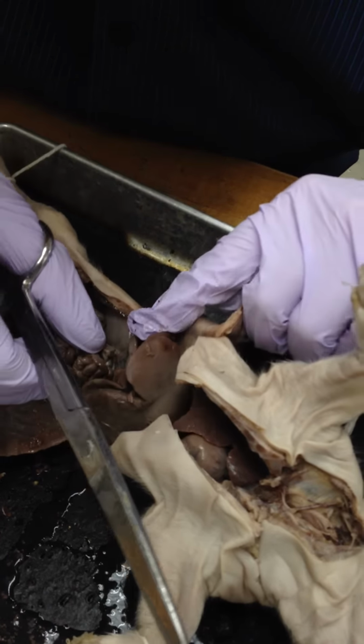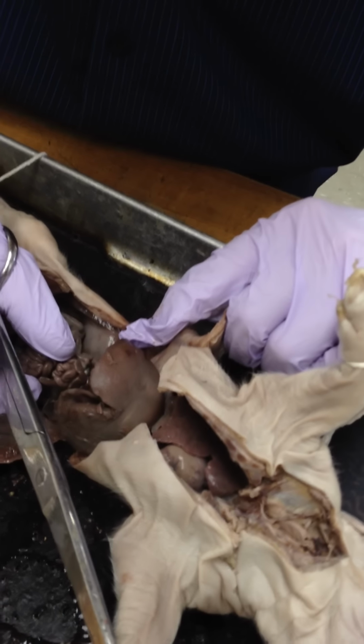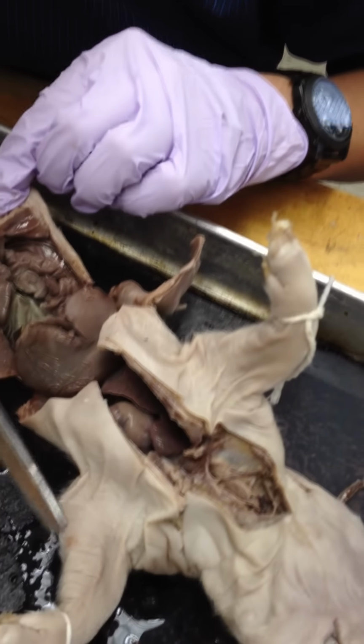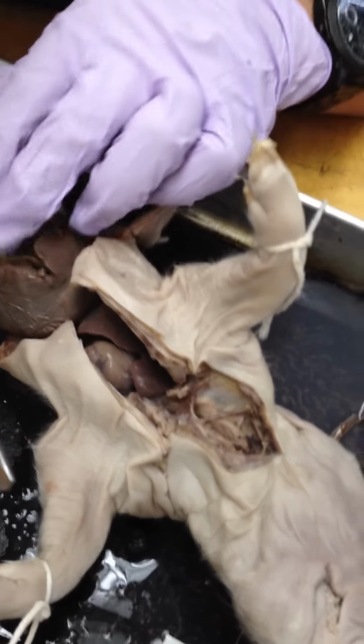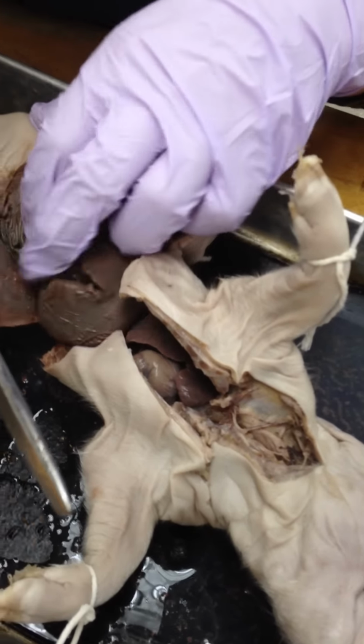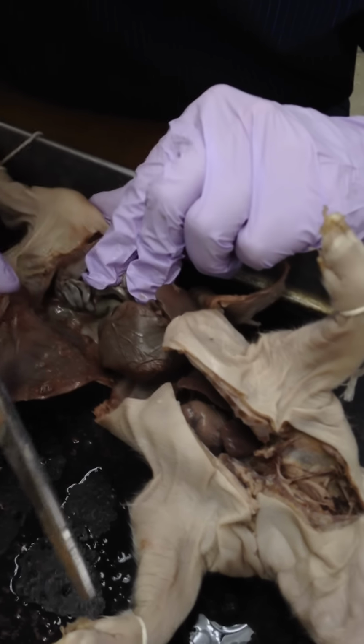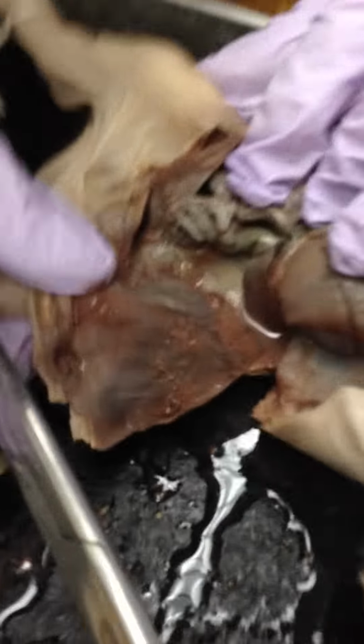Okay. Are you guys not? Well, I'm dying. Yeah. No, I'm dying too. Leo is like a soldier. He's going through that nerve gas, just like no problem. Yeah, I'm a soldier of academia. There's the other kidney. There it is, real good actually.